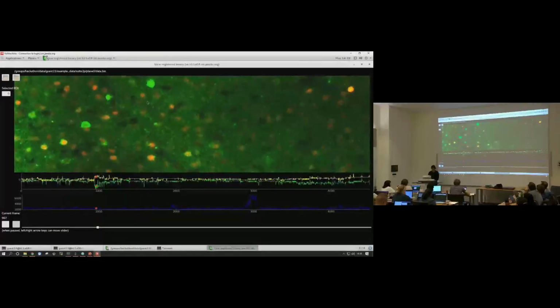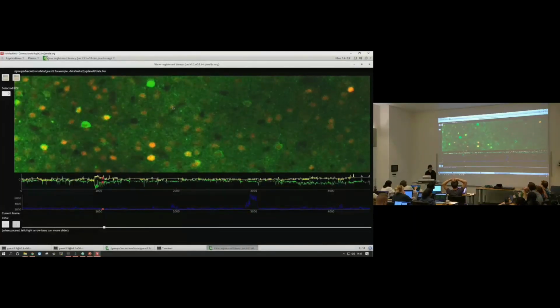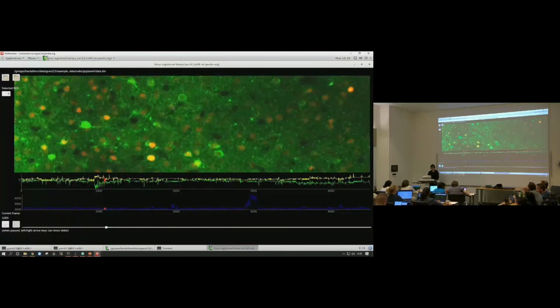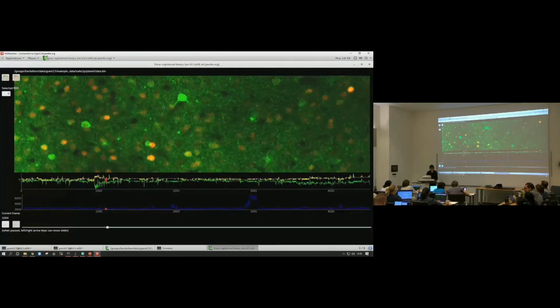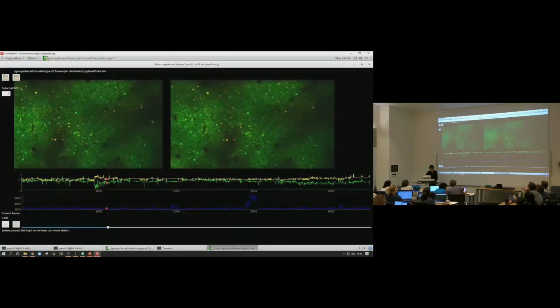Now, hopefully, most of what's happening is that cells are just becoming active or inactive. You can't really see large amounts of motion. You can try to trust your eyes with this, but you should also look at the registration metrics that we talked about to really quantify these things. For instance, Z-drift, you're not really going to be able to see very well by eye. How do you do that? It's coming. It's coming. Okay.